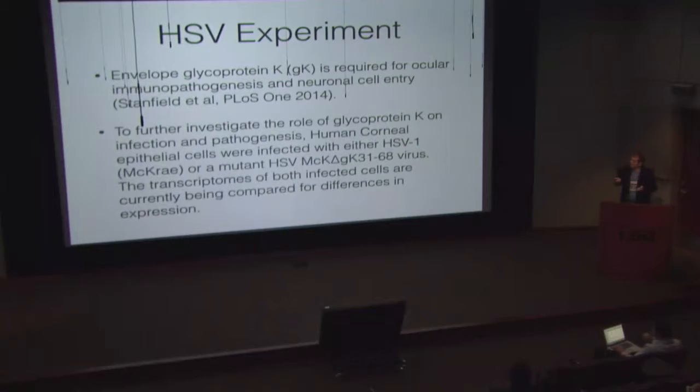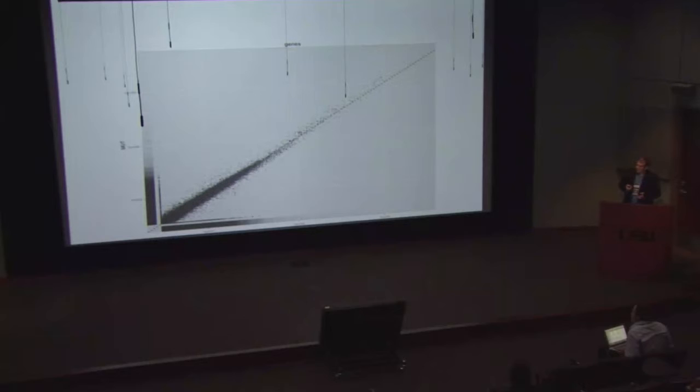Now, if we go back a few slides, I mentioned that I have my own test area and Partek. This is a gene scatter plot between mutant and the wild type. When I ran it through my pipeline on Bio-Linux, it showed a pretty good gene scatter. This is basically what I did. I apologize about the lack of title. It looked at wild type versus mutant gene scatter.